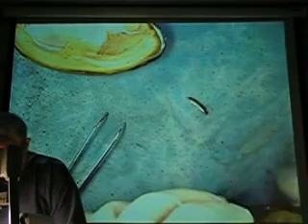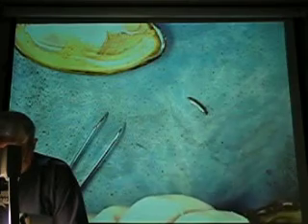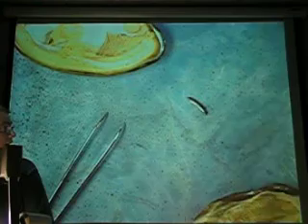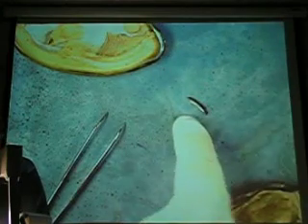Let's do another muscle that didn't show up too well. When you do a focused dissection — like when you guys were doing your dissection, you kind of had to see everything — a focused dissection is looking for one particular structure, like what I'll do on the lab practical. I tend to get rid of whatever's in the way. So if you see pieces that look like maybe something's been torn off, typically I'll leave it in the pan. If you see a gill over here, know that that gill went with that specimen originally and I tore it off because it was in the way.